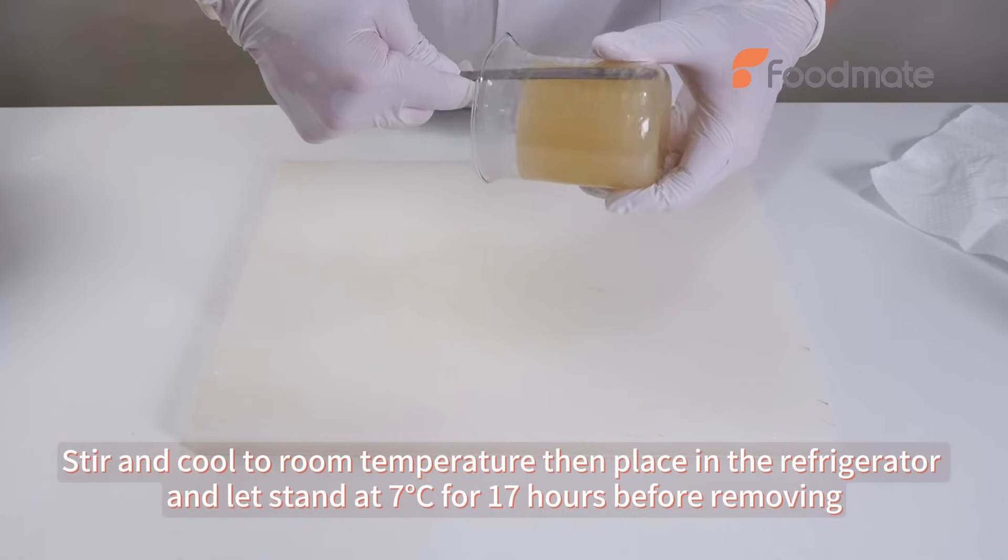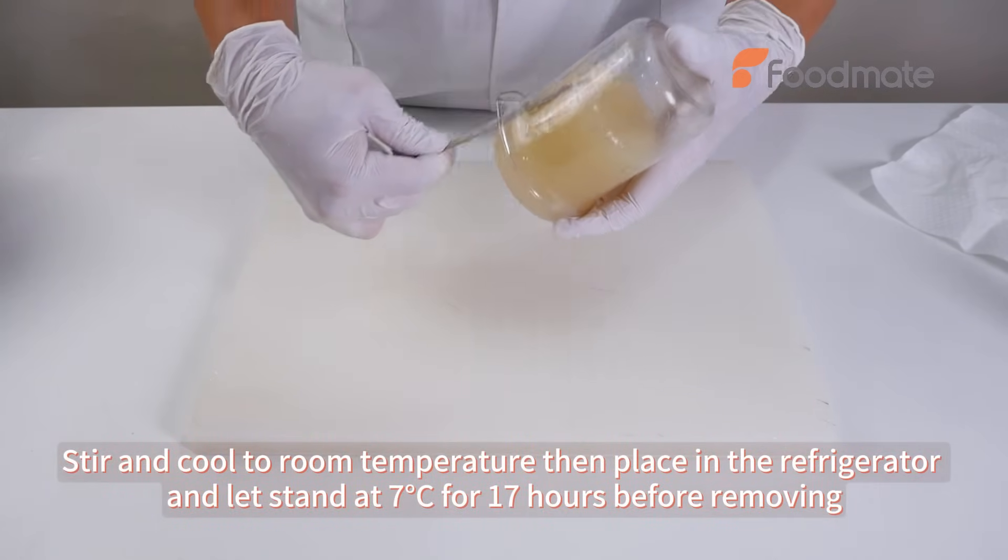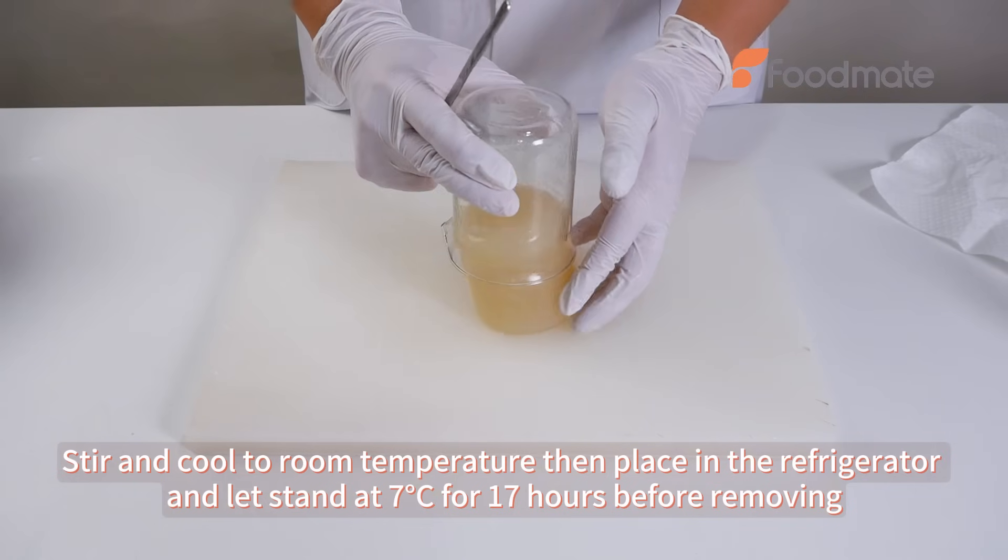Stir and cool to room temperature, then place in the refrigerator and let stand at 7 degrees Celsius for 17 hours before removing.